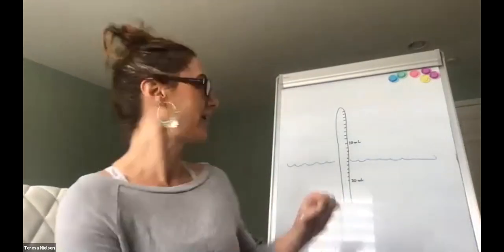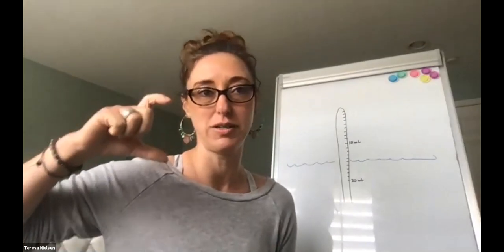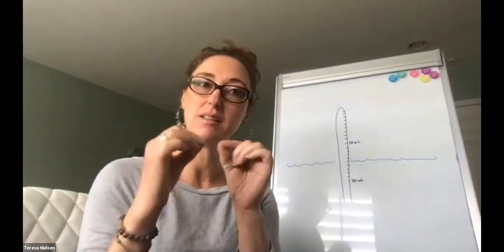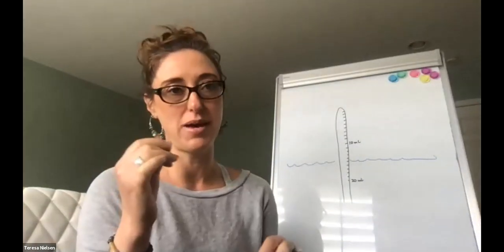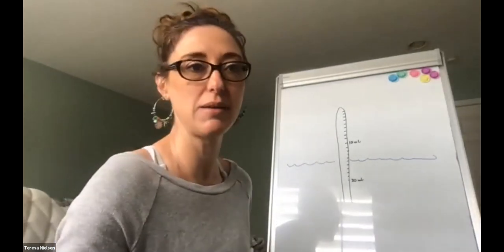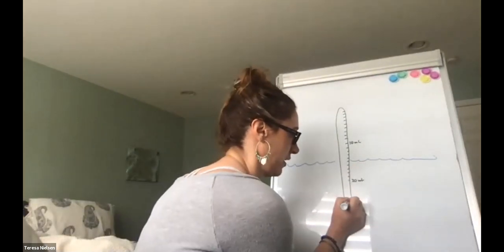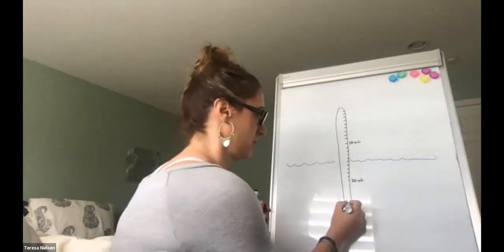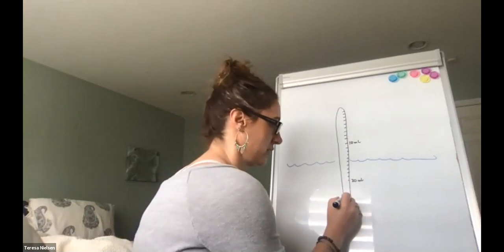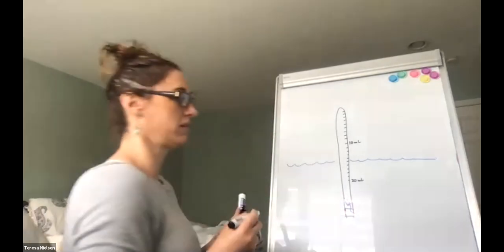Essentially what we would do here is we would take this eudiometer and we fill it. We put some 10 mils of hydrochloric acid in it. We fill it all the way to the brim with water. And then we take a little piece of magnesium. We will find the mass of the magnesium, tie it to a string. And so essentially what we end up with is a little piece of magnesium on a string. There's my magnesium on a string here. And we stopper it into the eudiometer. Okay, so we hold it in place with a little stopper there.